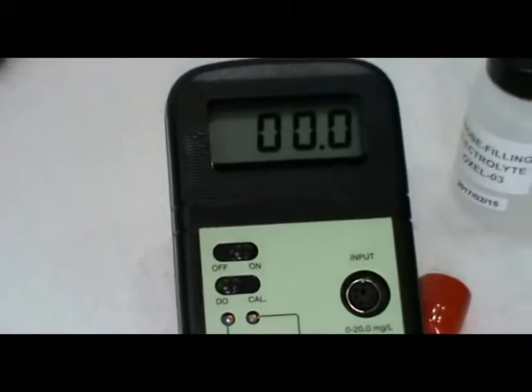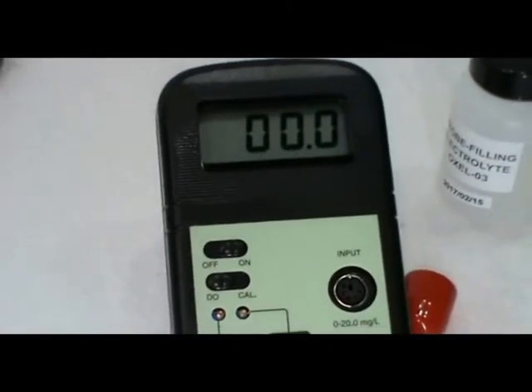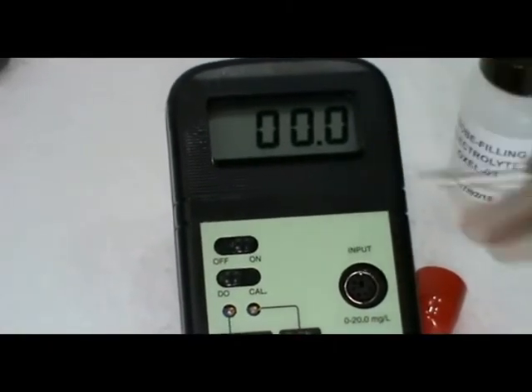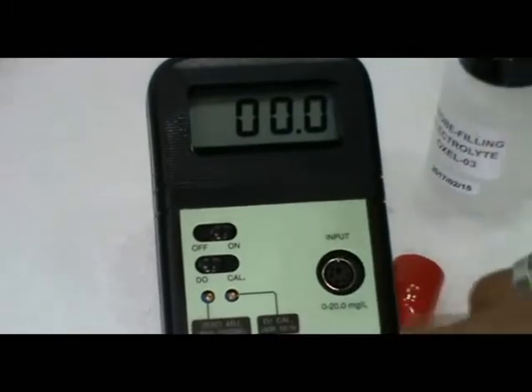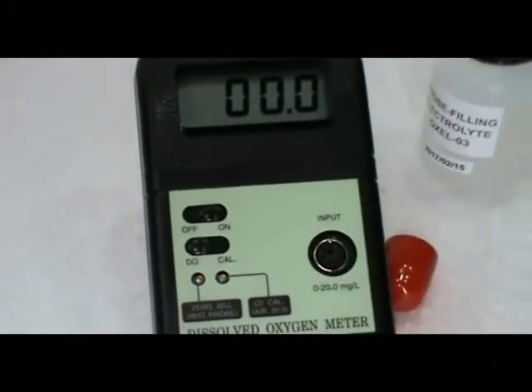Connect the probe. The display should show 0.0 value. Adjust using the screw.